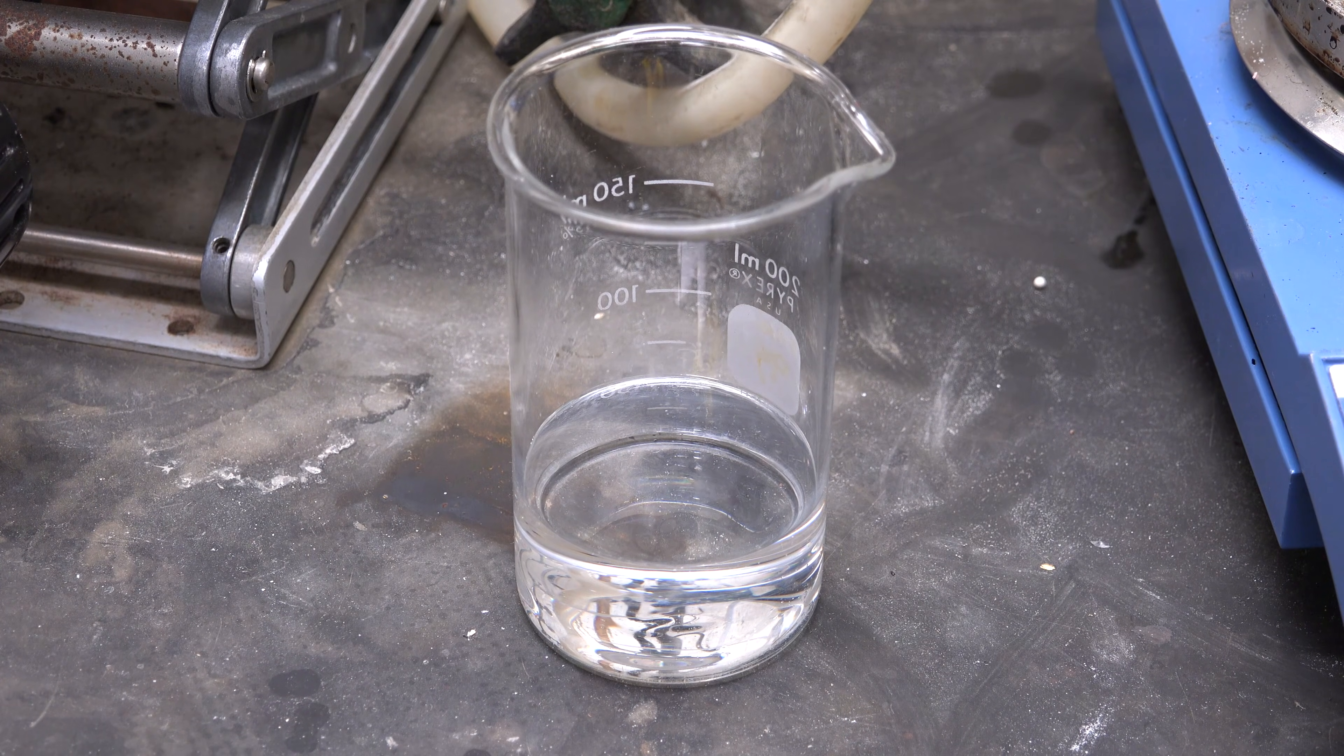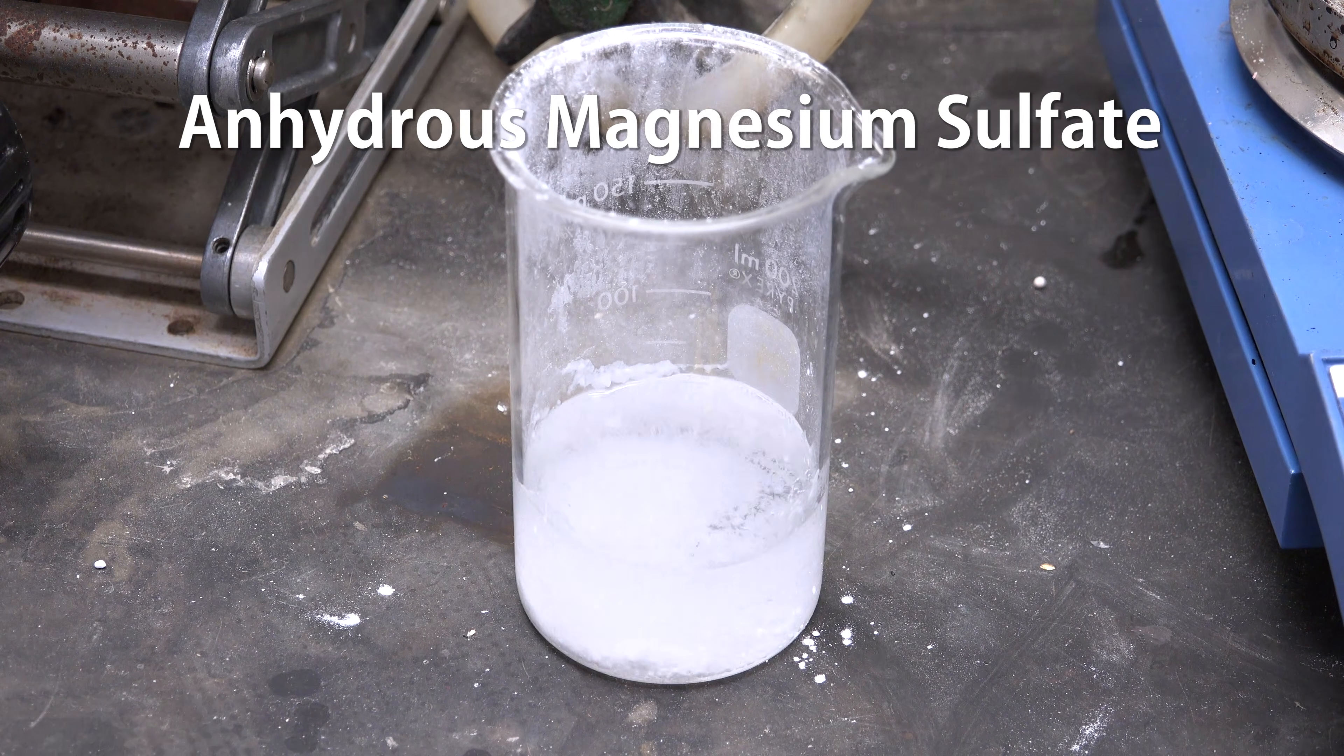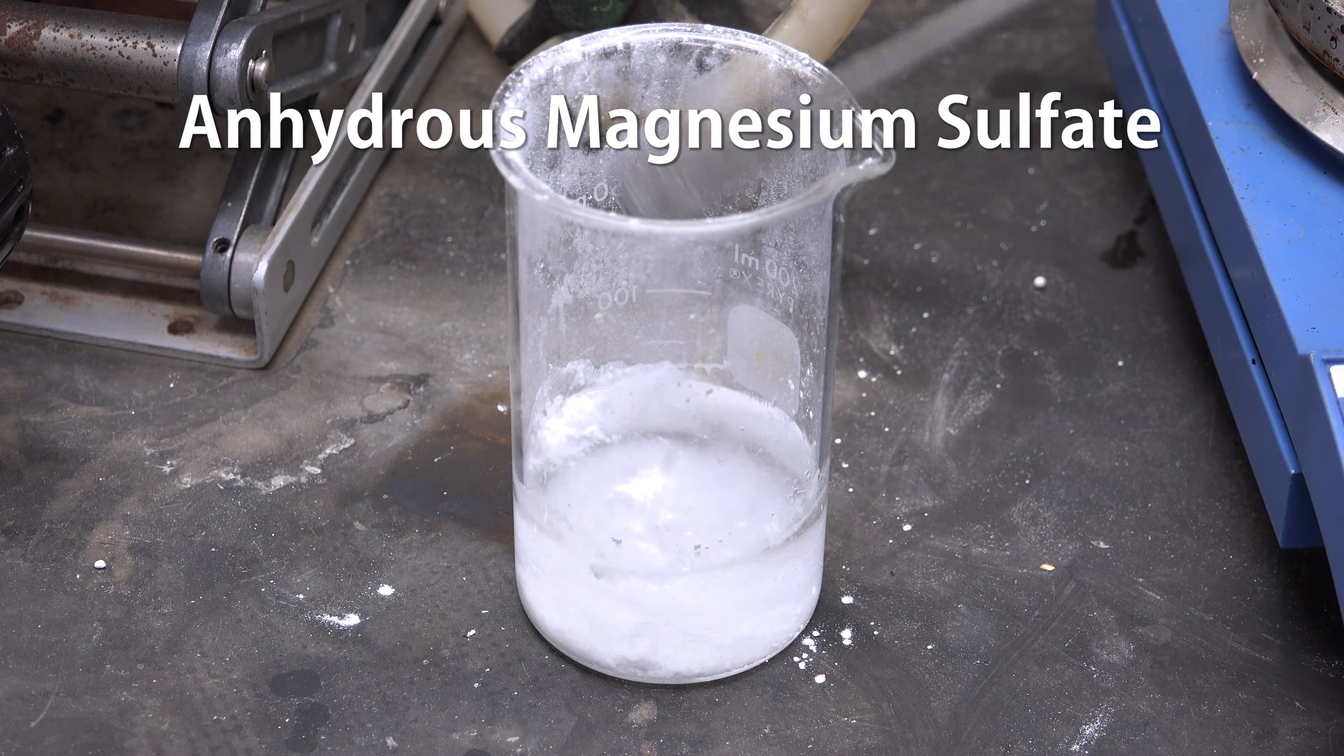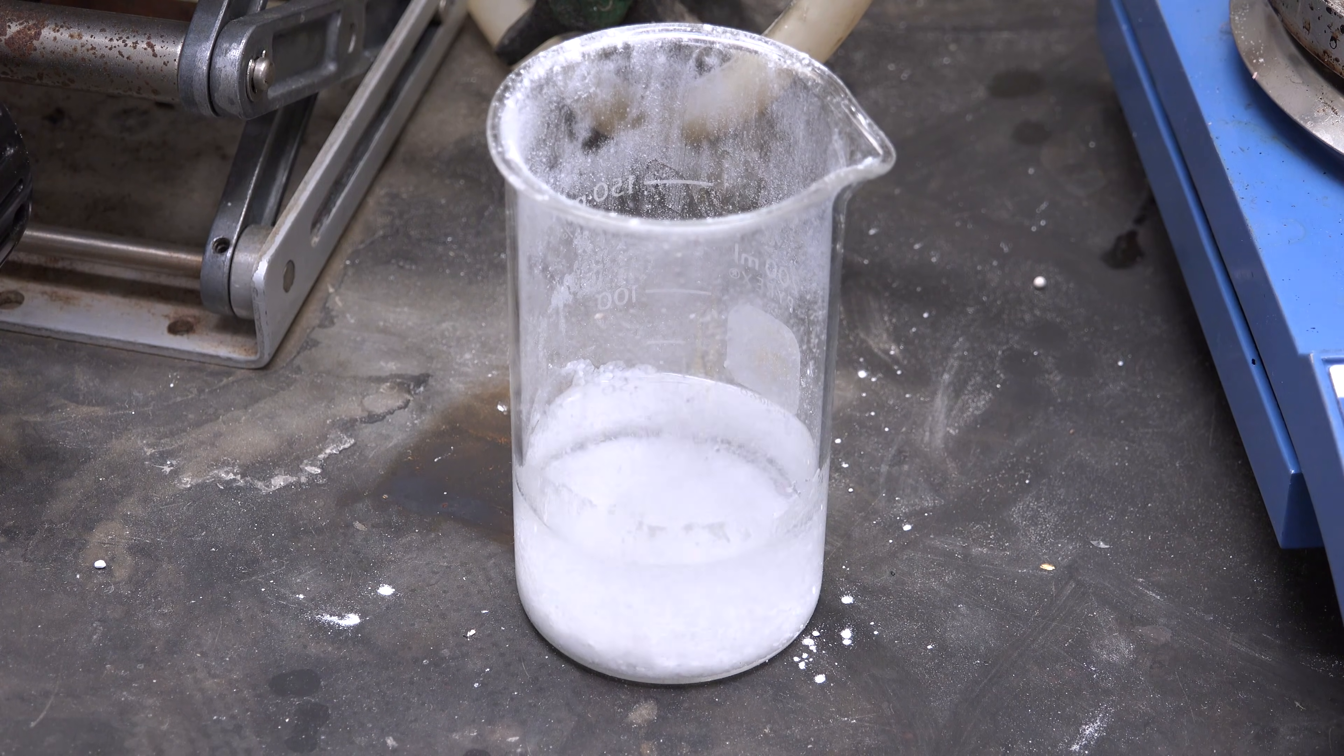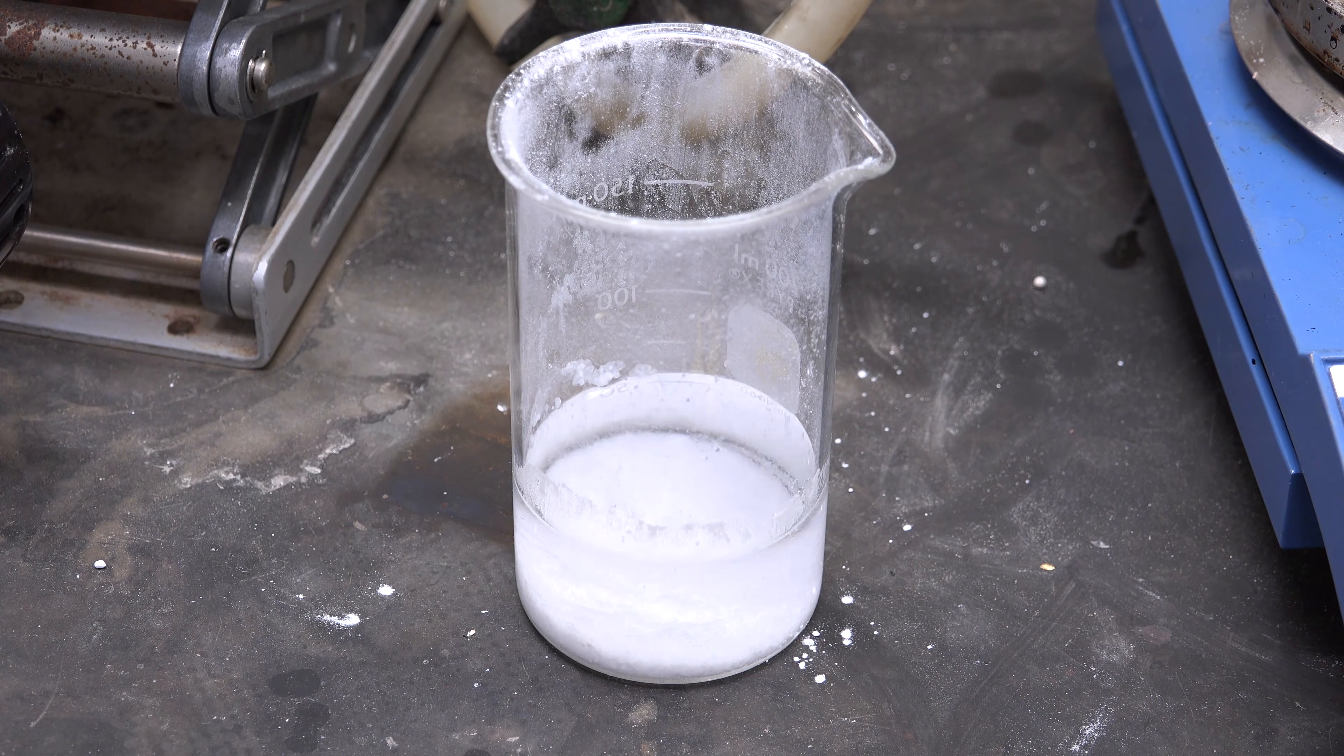And here is our bromoethane. It has trace water dissolved in it so you can add anhydrous magnesium sulfate if you wish to remove it. It also contains small amounts of diethyl ether. I'm going to leave that in but if you wish to purify it further then you can use fractional distillation and collect the fraction that boils at 38 degrees celsius.